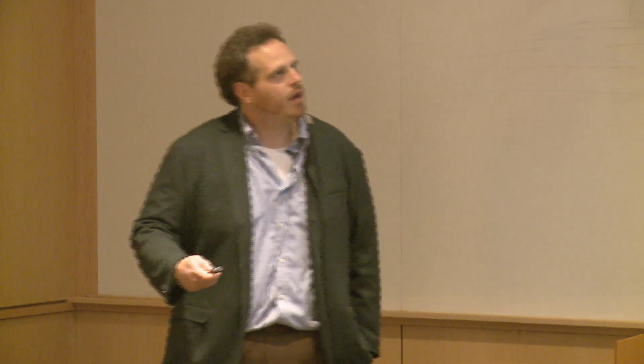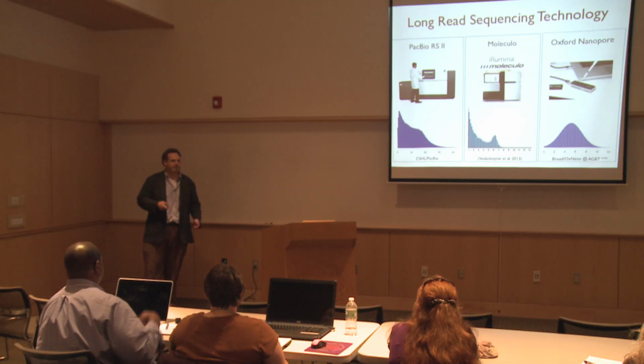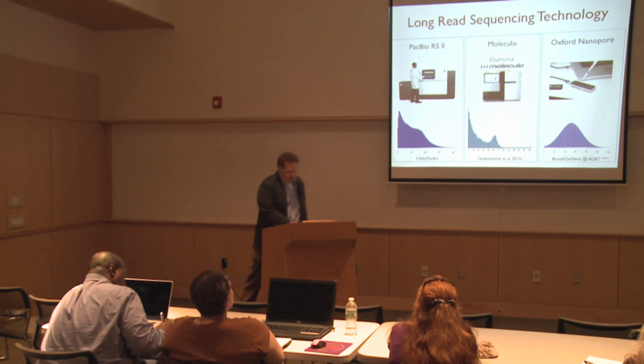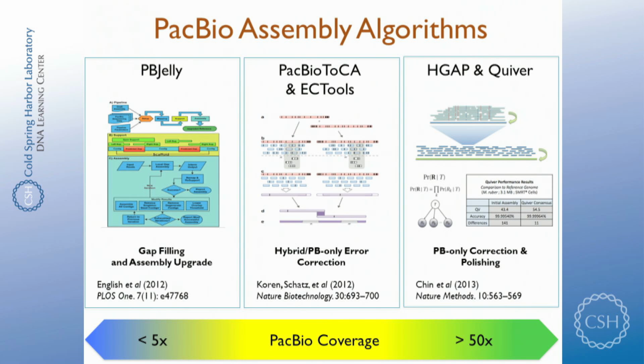It's going to be challenging for a while to figure out how we're going to use these effectively, but super cool for the future. Potentially very scalable, right? We can go from thumb-sized devices to many of these, and actually that's their product line, is to scale it up to these bigger instruments. The challenge for this, even with PacBio, is the very high error rate compared to Illumina sequencing. Depending on the run and the day of the week, it's between 10 and 20% error.